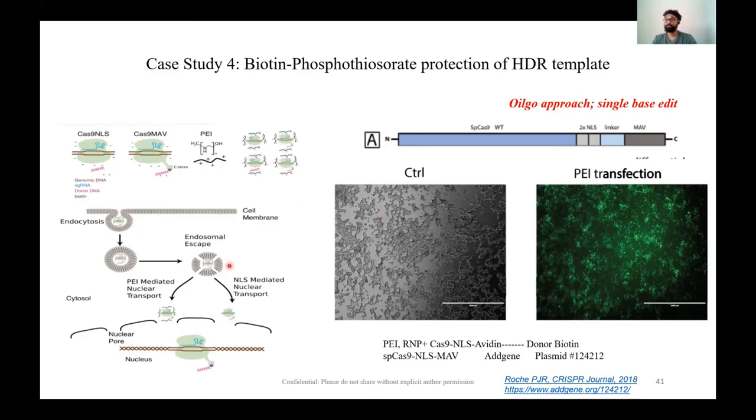They also use something called PEI, right? This is a really robust and highly cheap method. It ensures that your plasmid remains inside the cell for up to 4 weeks. I would not recommend it for primary cells because of the sheer off-target effects that it might have.